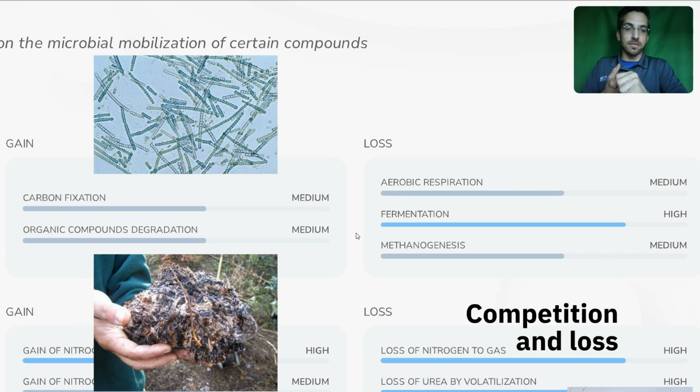And so ideally, we would see substantial numbers of aerobic organisms and of fermenters. The methanogens we can do without, but as long as you do have oxygen breathing organisms, unless you're a rice crop, unless you're a crop that needs to be saturated, then that's the main thing. Do we have aerobic respirers, or are they completely outnumbered by the others?